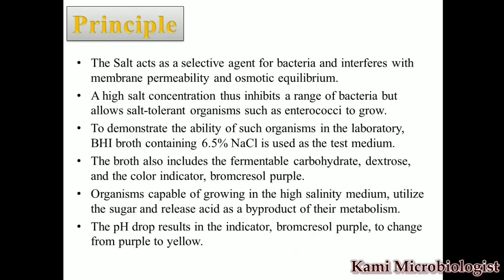Now let's see the principle of this test. We have the salt. Remember, salt is acting as a selective agent. Why? Because if salt tolerant bacteria are present in a mixture, we can easily isolate that type of bacteria. We also have membrane permeability and osmotic equilibrium, which is also affected by the addition of salt into a medium. Let's suppose we have a high salt concentration, so what will happen? Other types of bacteria will die and only salt tolerant bacteria will grow.